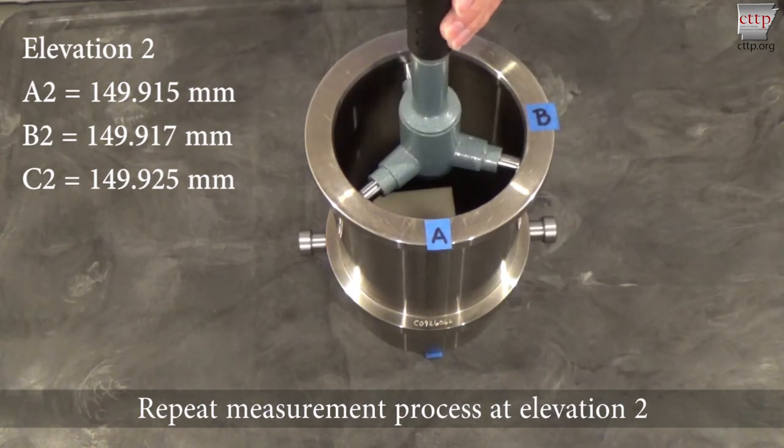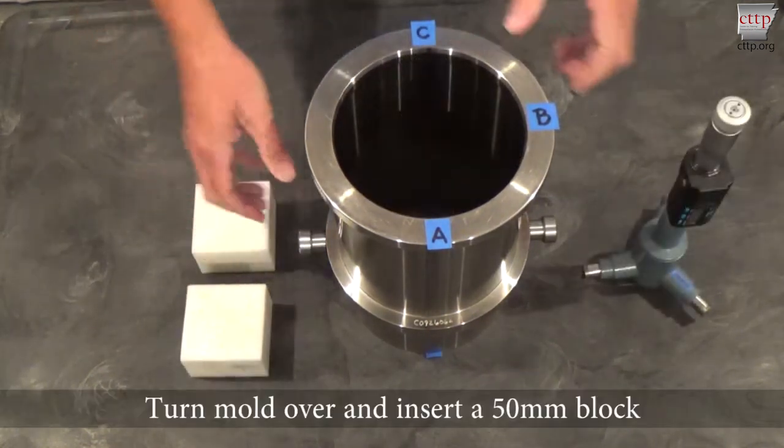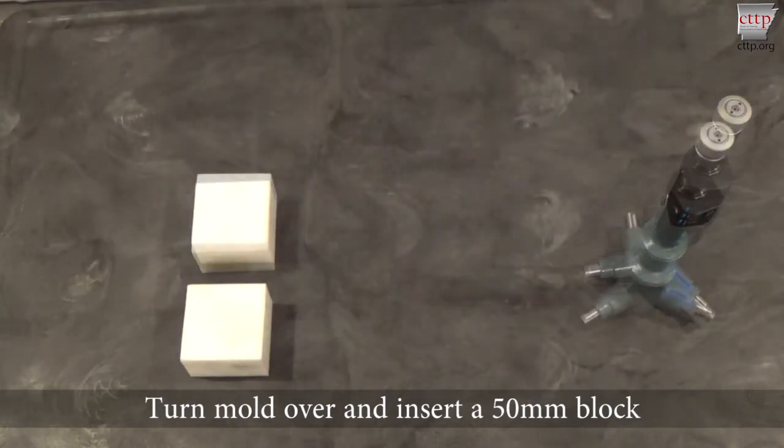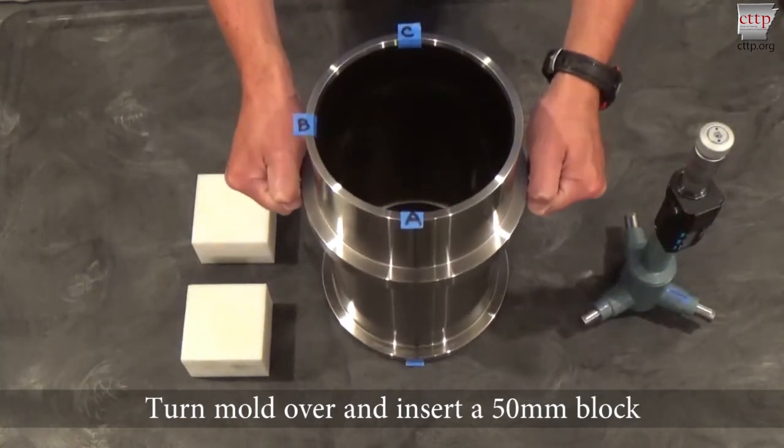Loosen and remove the bore gauge from the mold. Turn the mold over and insert a 50 millimeter block. This is elevation 3.